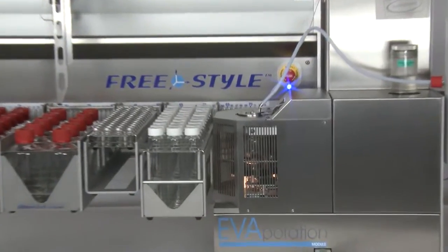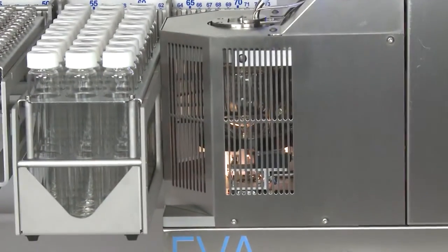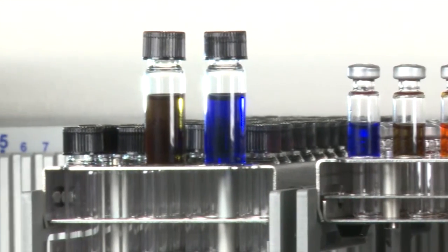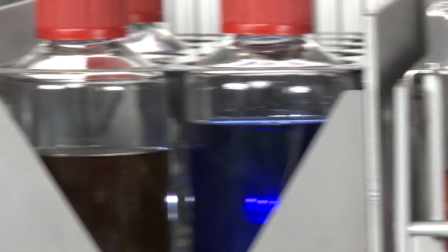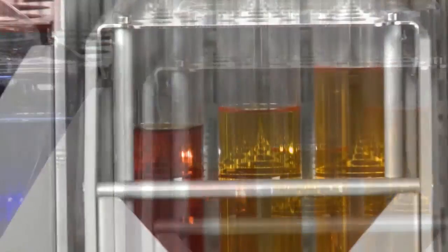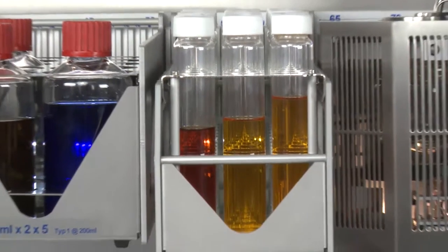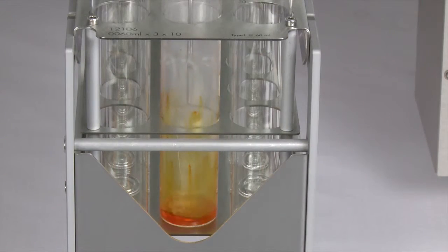The freestyle system with the evaporation module has many different uses. It may be used as an automatic evaporator controlling samples with undefined volume, evaporates to a freely selectable target volume, and even rinses the sample container.